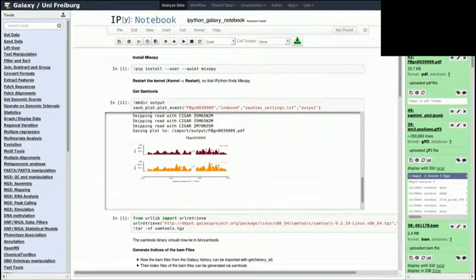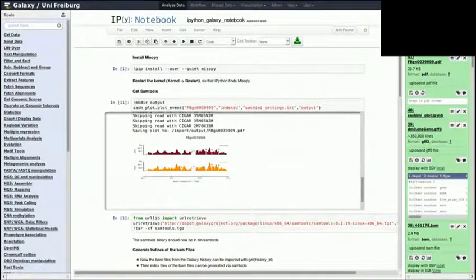So what you currently can do is you just write such a notebook for the user. You can document it, as seen here. So you can really document every step. And then you can just send this dataset to your user because it's just a Galaxy dataset, as every other Galaxy dataset. And you can share it with users, you can upload it to the data library and tell your user, hey, please take this notebook, run it, insert your data, and then just run my analysis. And in the end, it will produce a dataset in your history, done.